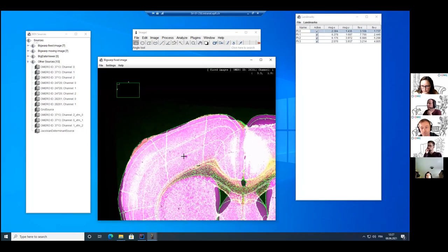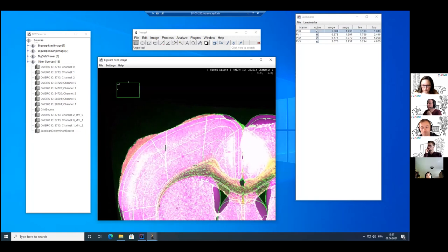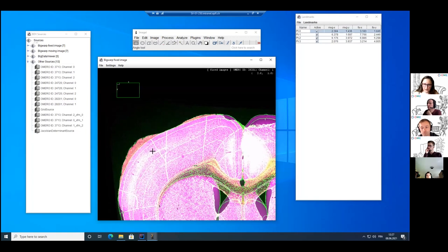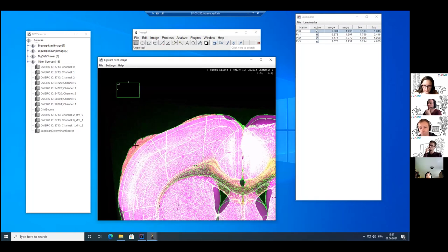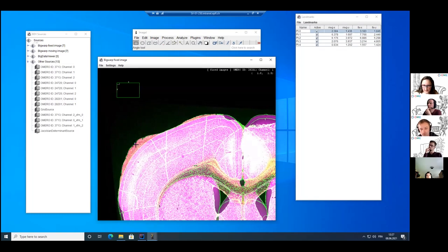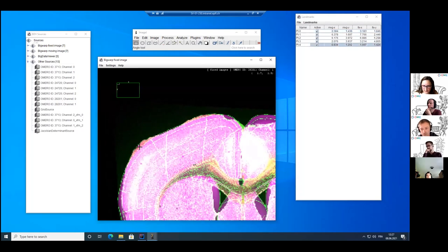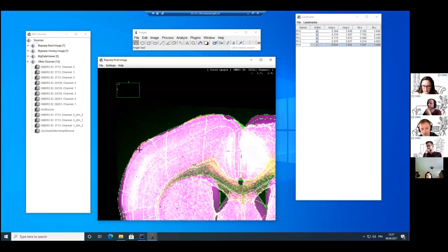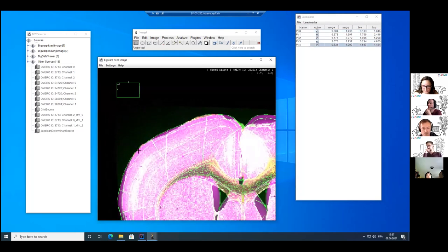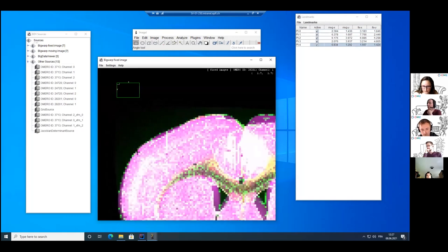So this is kind of okay. And if I want, I can add as much points as possible. So with control click, here I have one more point and I can drag and drop it again to adjust and fine tune my mapping.